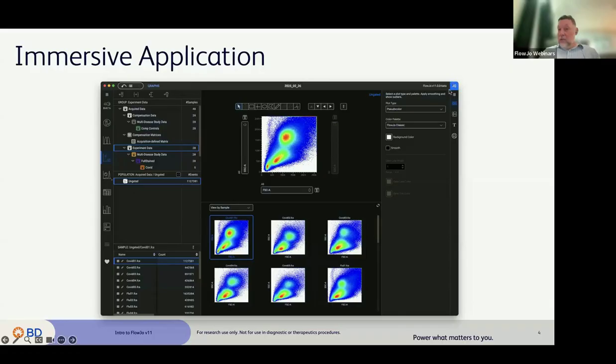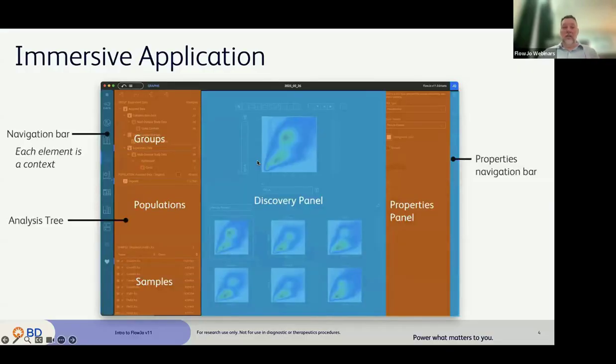And then this little pancake icon at the top will hide the drawer so you can make more room for the center plot. So we can actually hide this side drawer and this side drawer and put everything in the big screen for the focus of the context you're interested in.